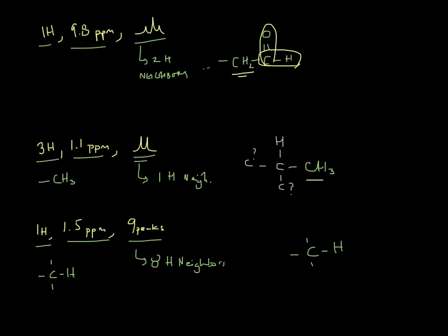You can't, of course, have a CH8, but because this is just a CH, you know that that carbon has to have 3 more bonds. On those 3 bonds total, there need to be 8 total neighbors. So let's just start drawing them in. 8 neighbors, none of these could be CH4s, so it's got to be a CH3, which is 3, and a CH3, which is 3 more, so that's 6. Meaning that it can't be another CH3, that would be 9 neighbors. So we've got to have a CH2 over here to give us 8 neighbors there.